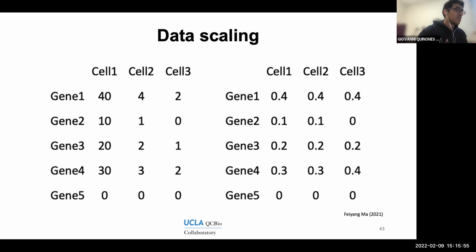If you think of gene 1, for example, that tends to be very highly expressed throughout cells, and gene 1 always has the highest count, say it has 1,000 reads, whereas the other genes have very few, less than 10.